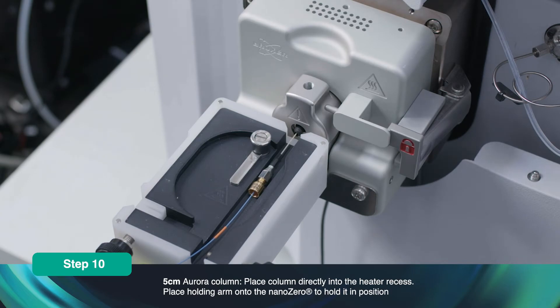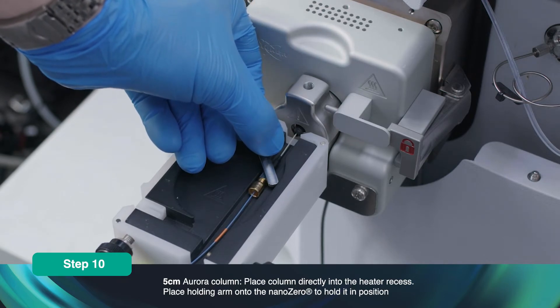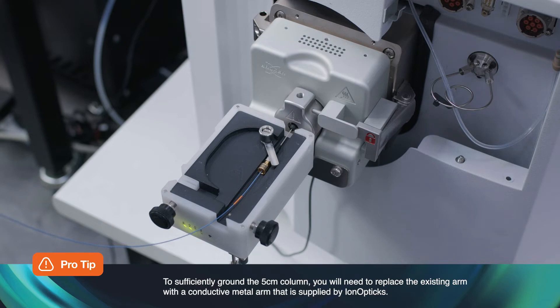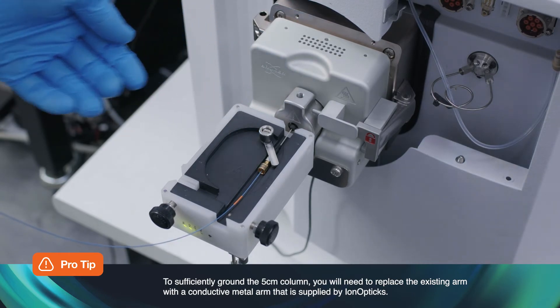For the 5cm Aurora column, place the column directly into the heater recess. Place the holding arm onto the Nano Zero to ensure that the Nano Zero is grounded and held in position. To sufficiently ground the 5cm column, you will need to replace the existing plastic arm with a conductive metal arm that is supplied by Ion Optics.